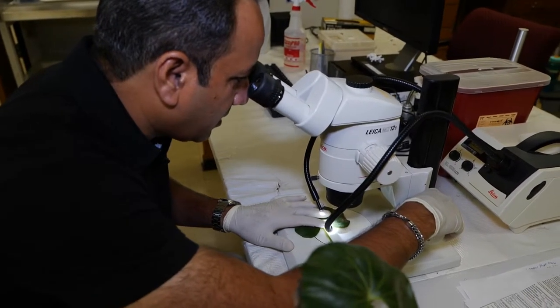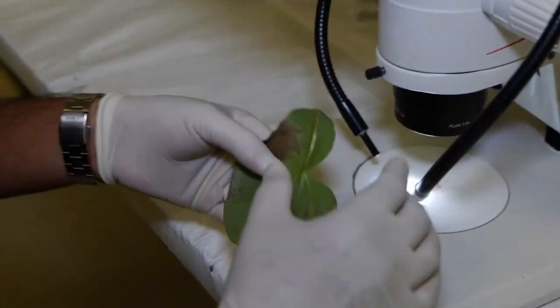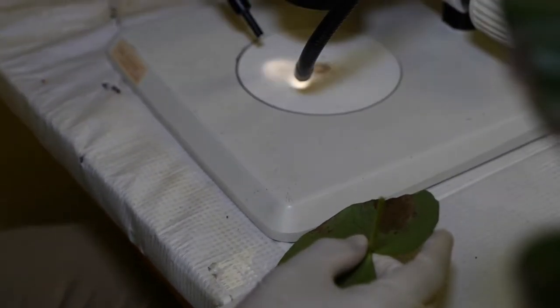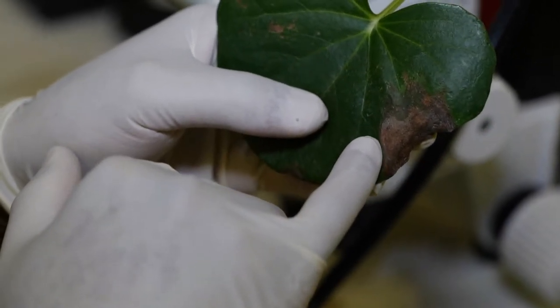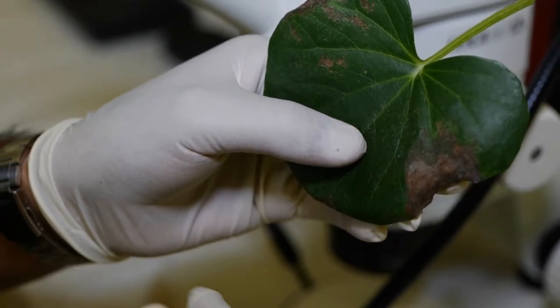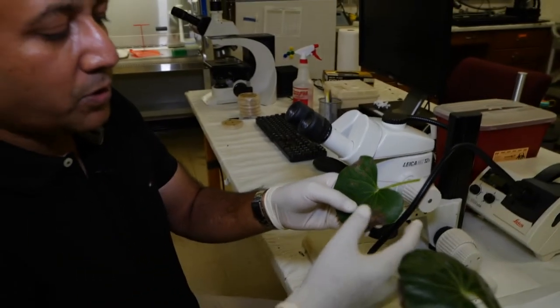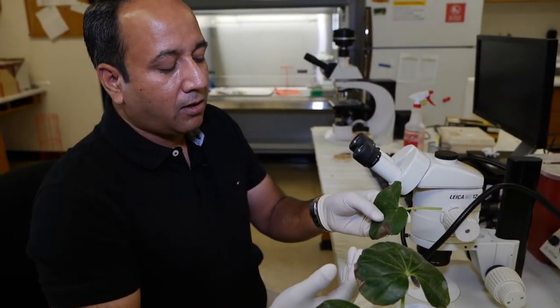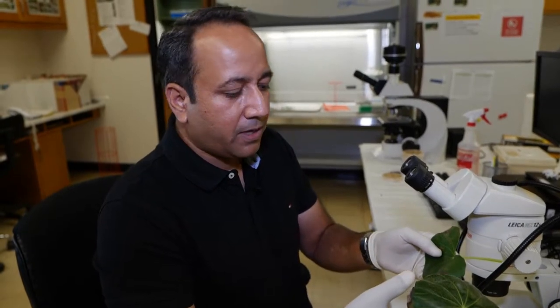After this, what we like to do is cut this tissue out from the transition zone where you have the healthy and the dead part, and then plate it on different kinds of media in order for it to grow out of that medium. Then we can ID it depending upon what kind of spores it's producing, what kind of bacterial colonies it's producing. If it's a fungal pathogen or bacterial pathogen, we have an idea what we're dealing with. Viruses you can't culture out, so we have different tests for viruses.